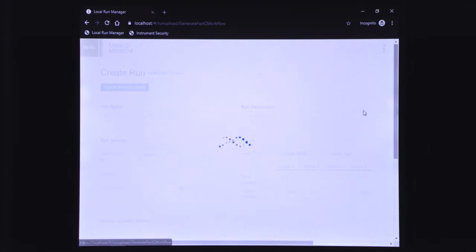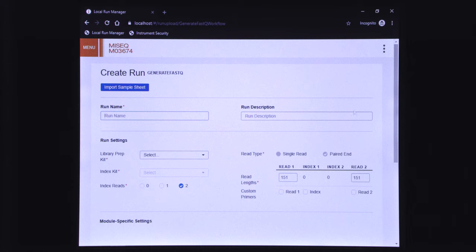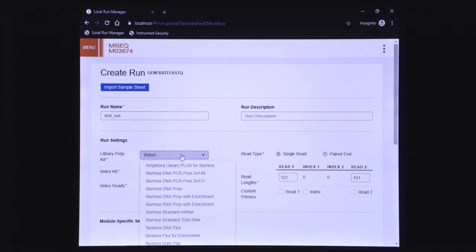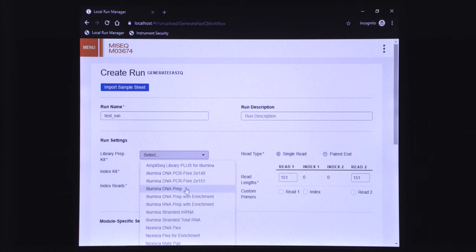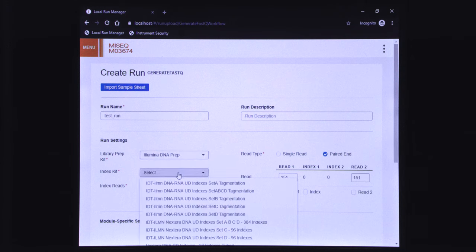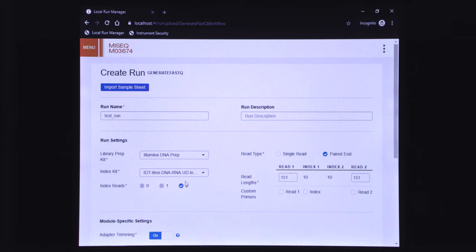On the next screen, fill the details of your run, including the run name, the library prep kit, the index kit, and the desired read lengths.